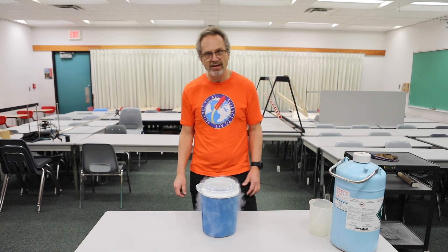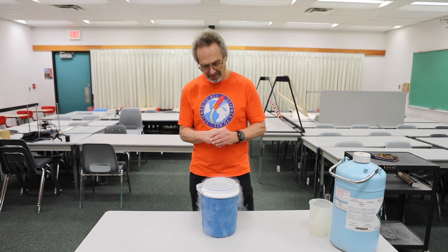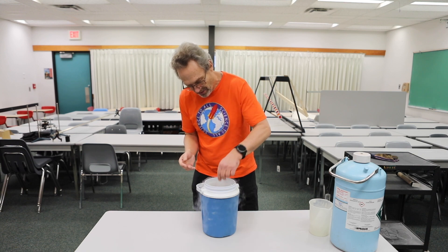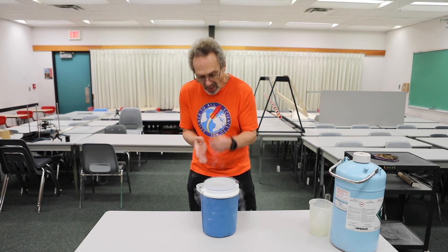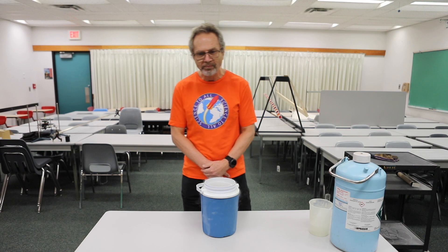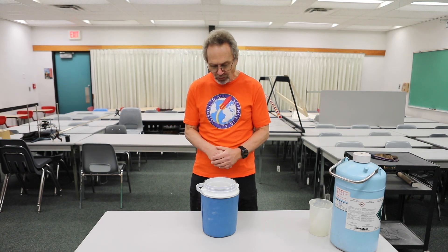And then I'm going to do something that you would think would be kind of foolish. I'm going to take one of these crackers out. Let me see if you can guess what I'm going to do with it. Got to be quick — it's cold. Mmm. Another one.